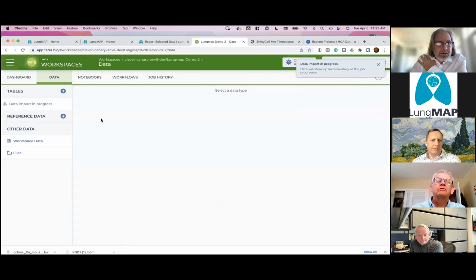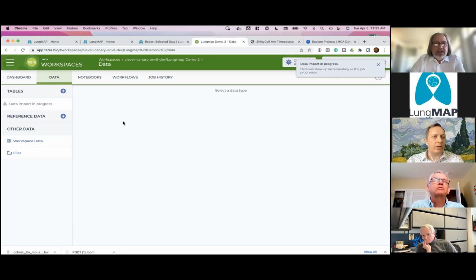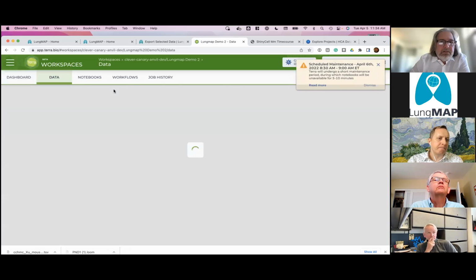Tim, I don't know if you want to fill in here or describe what's going on. Yeah, I can jump in from here if you'd like. Yeah, sure. Okay, cool. And so would it be okay if I share my screen and start working from there? Yeah, sure. There you go. It's done. Here it is. It's done. And so then I can say, you saw what Tim, refresh. It's asking me to refresh.